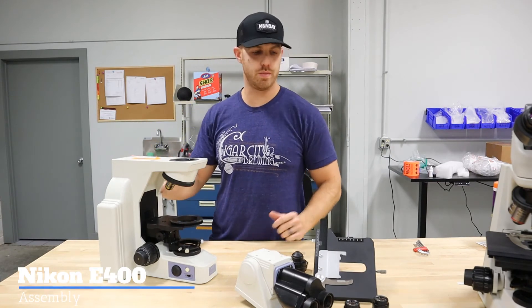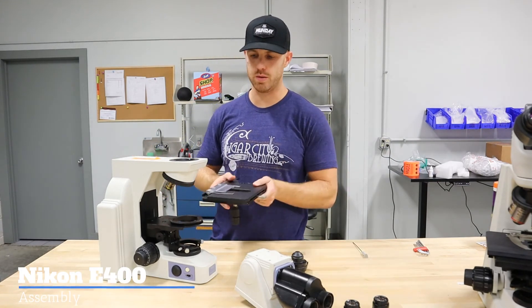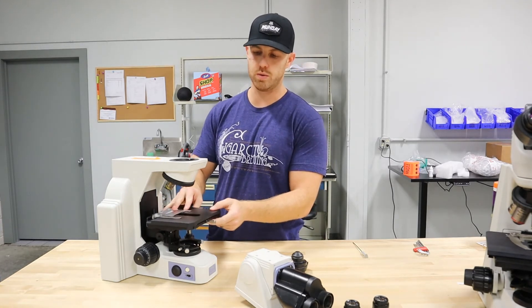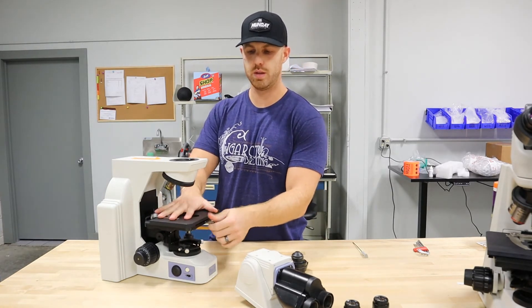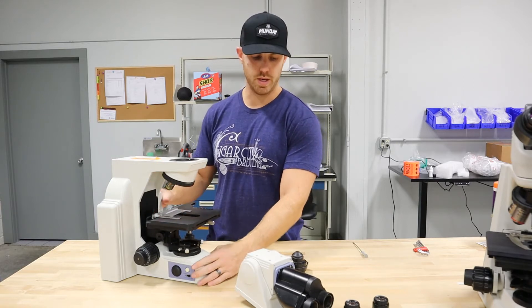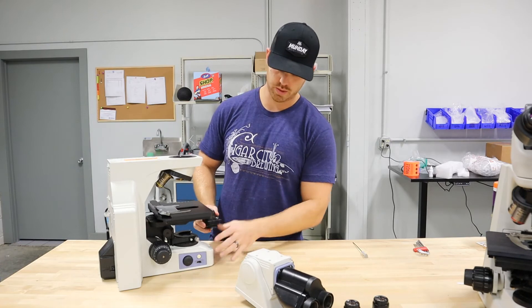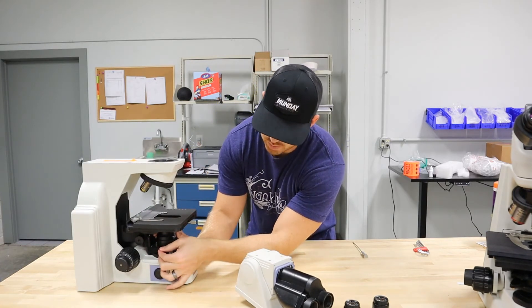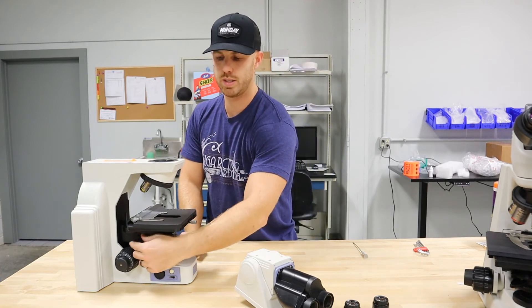We're going to do the reassembly of the microscope now. First, we're going to put the stage back on. You want to make sure that the stage is flat and not at an angle, and lock it down with the thumbscrew. Next, we're going to put the condenser on — slide it in on the sub-stage, lock it down with that thumbscrew, and raise it on up.